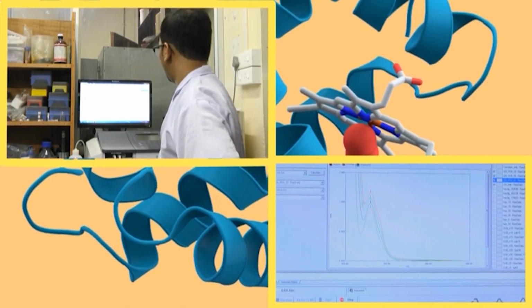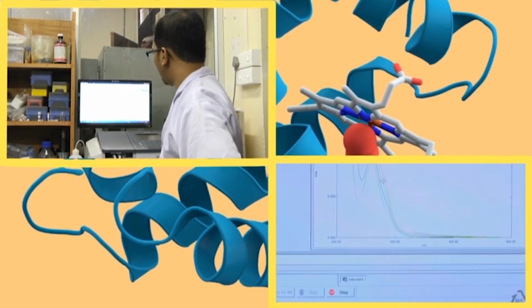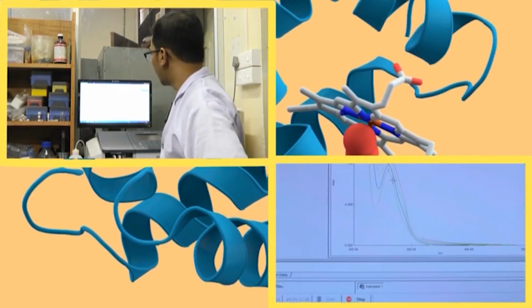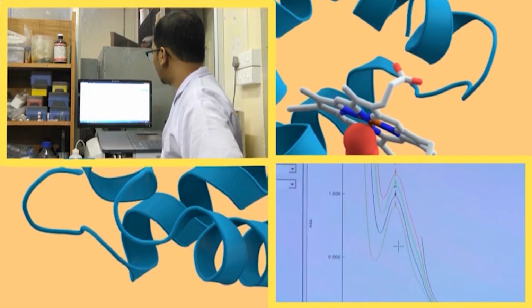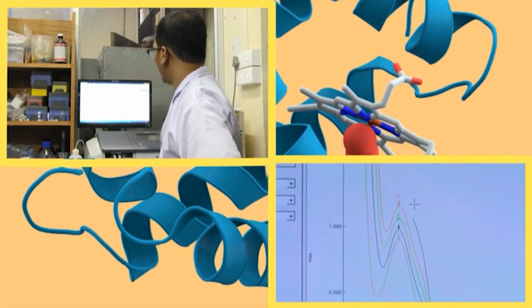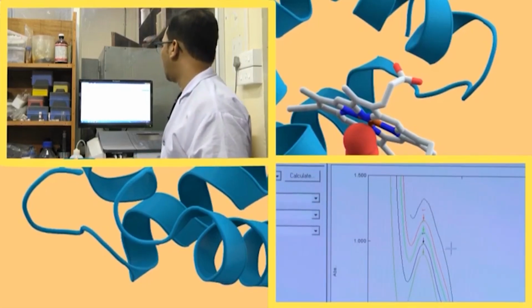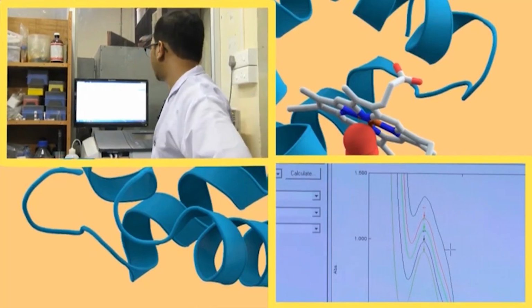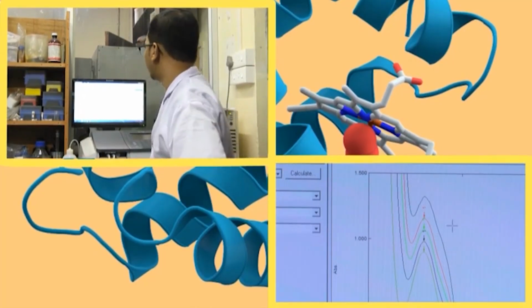Here we can see the value gradually increases. So, this part is actually enveloped. Here we can see a small hump. This red line and blue line, green line, here you can see a small hump is arising, a small hump followed by another peak. So, this hump is basically due to the absorbance of HSA, because HSA gives this hump around 280. So, HSA gives around 270, 280.